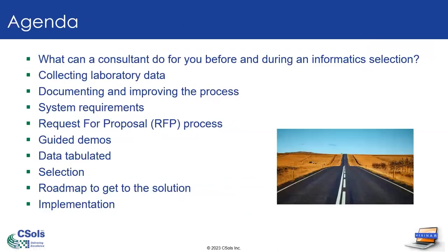So today's agenda, what we're going to discuss is what can a consultant do for you before and during an informatics selection? What role might they play? How will they help you accomplish your goals for selecting the right system? We're going to talk about collection of lab data and documenting and improving your current processes. We're going to discuss how system requirements play into the system selection.